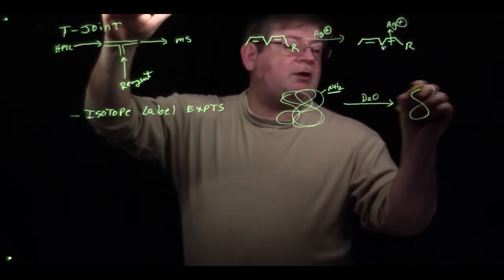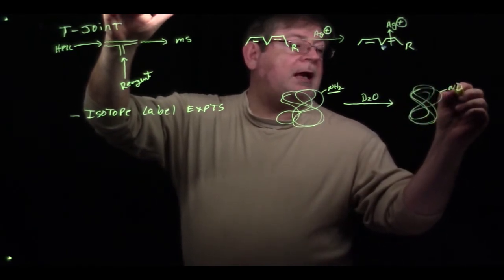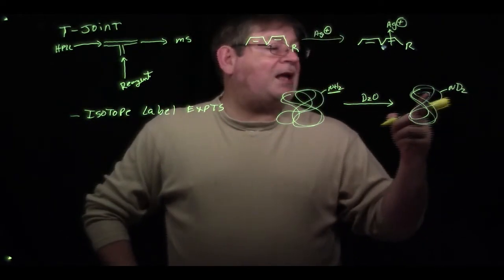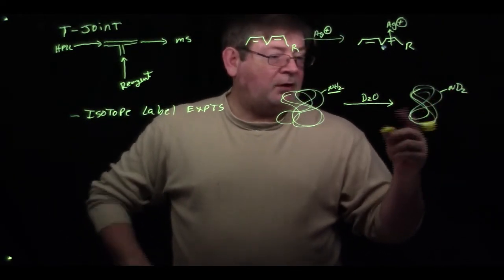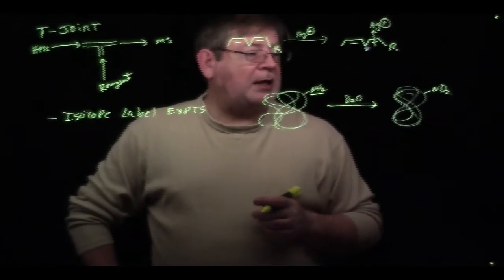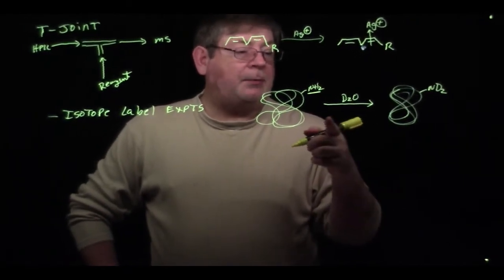And so you'll then actually form the protein, and you can exchange off the hydrogens on the amine with deuterium. What that does, obviously, is make the protein heavier, and so you get a mass shift in the particular mass spec that you're looking at. So this is pretty easy to do. Now, of course, this experiment is overly simplified.